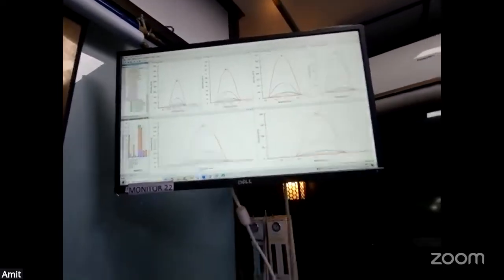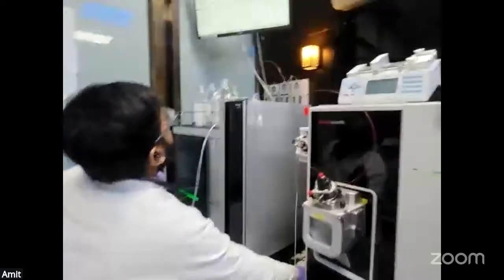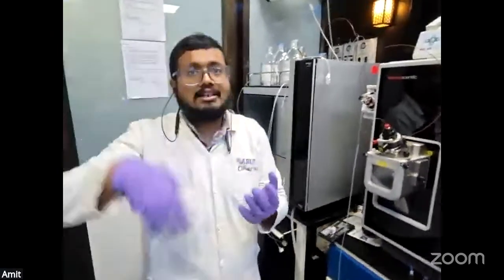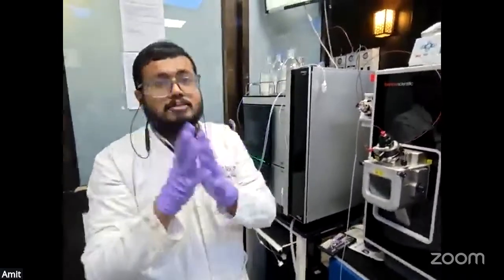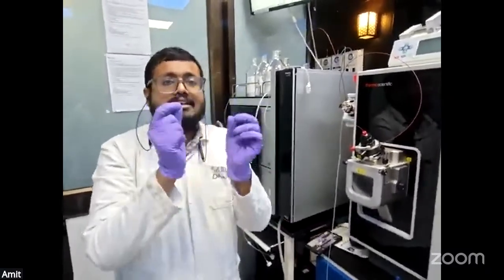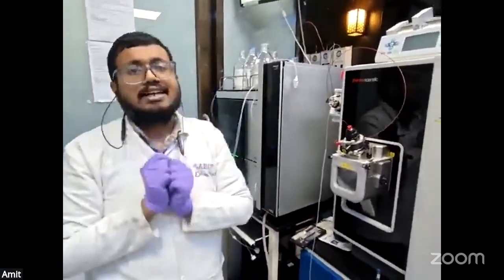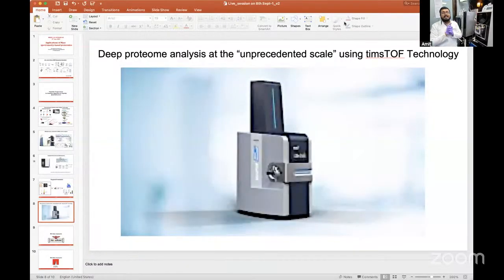Since this will give you the areas of all these particular transitions, it will give us the quantification, that is, the actual intensity. But as I have shown, it is quite specific because we can measure the precursor-product pairs, and that's why it is unique and known as targeted, and we can precisely validate here whatever list we have identified in global. Yeah. All right. So, thank you, Ankit.